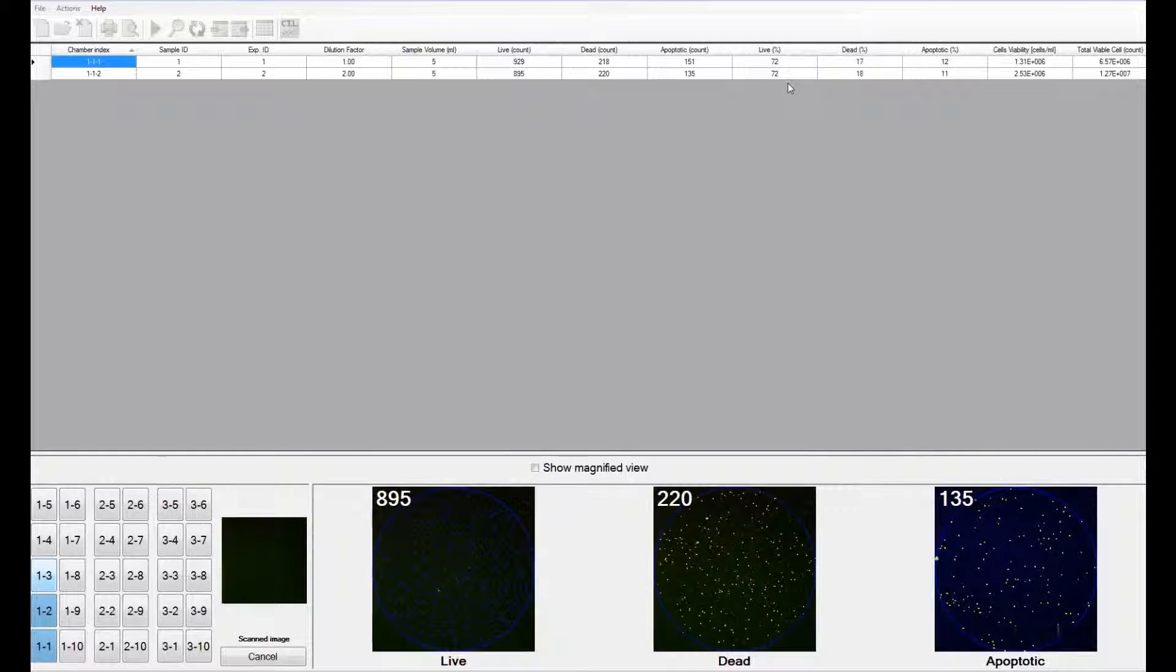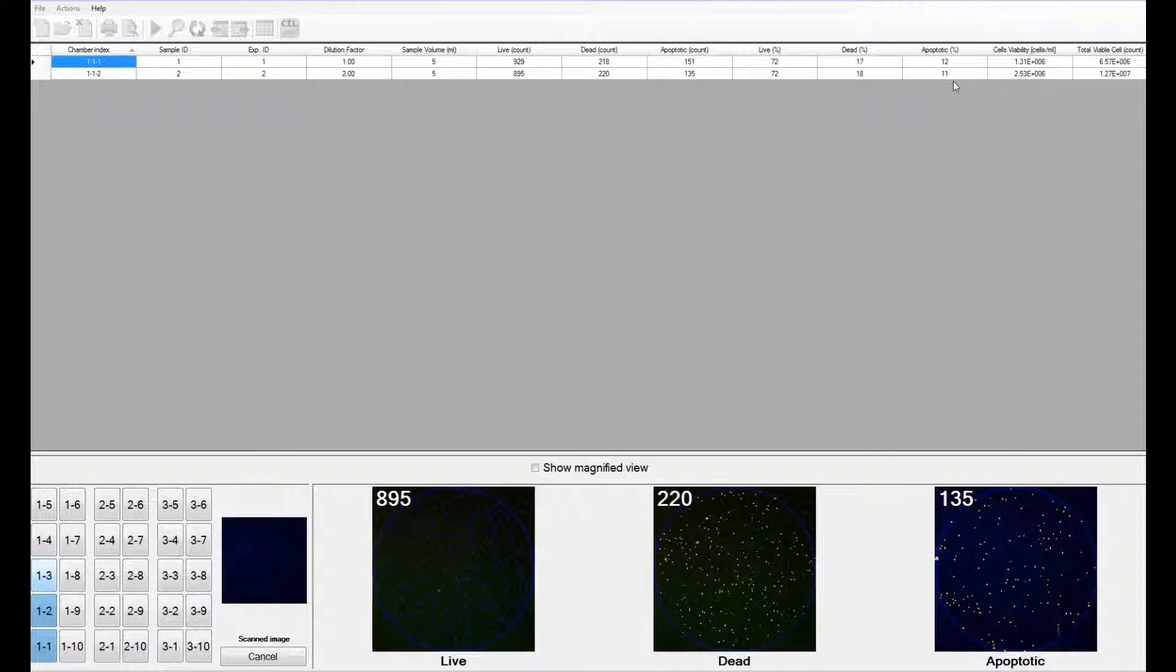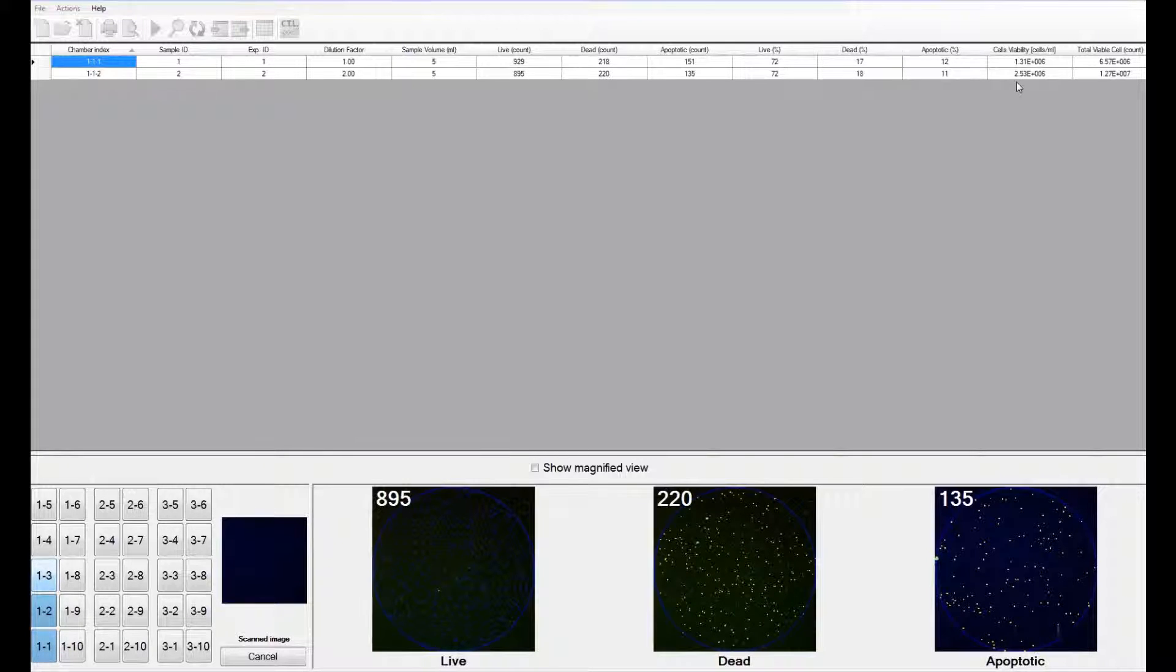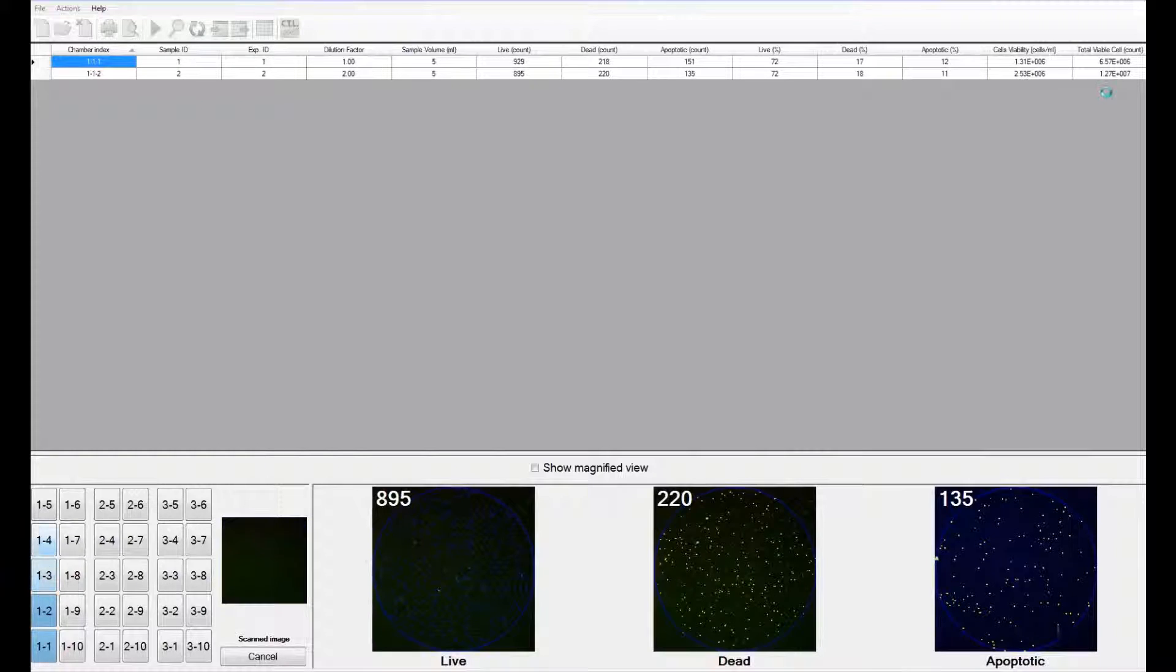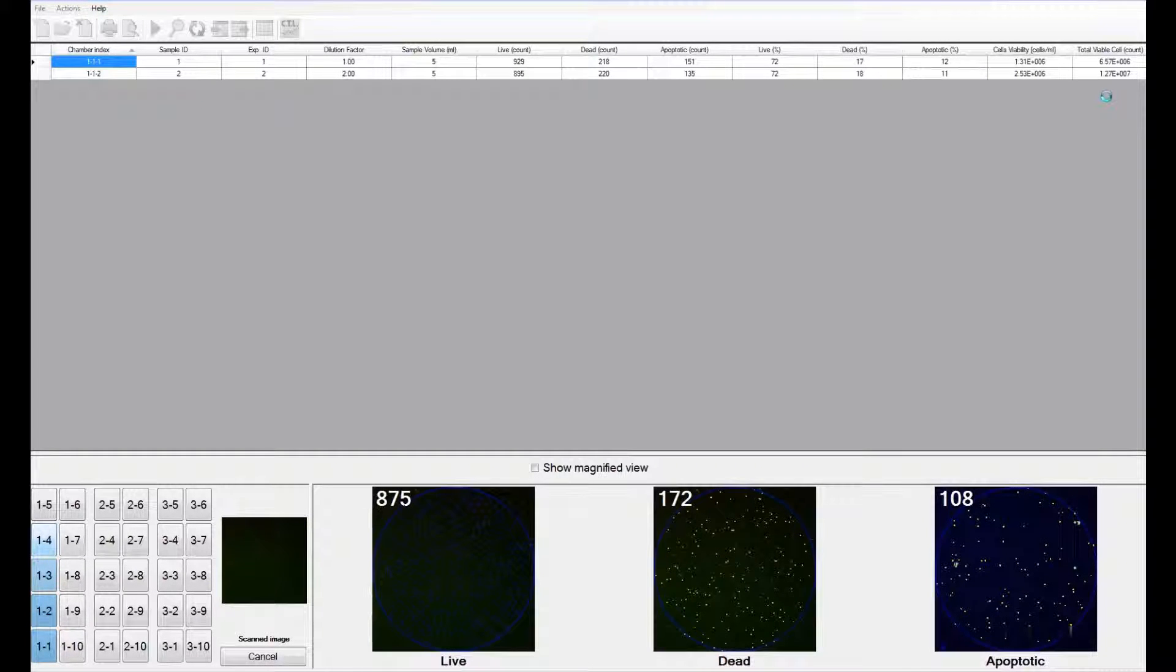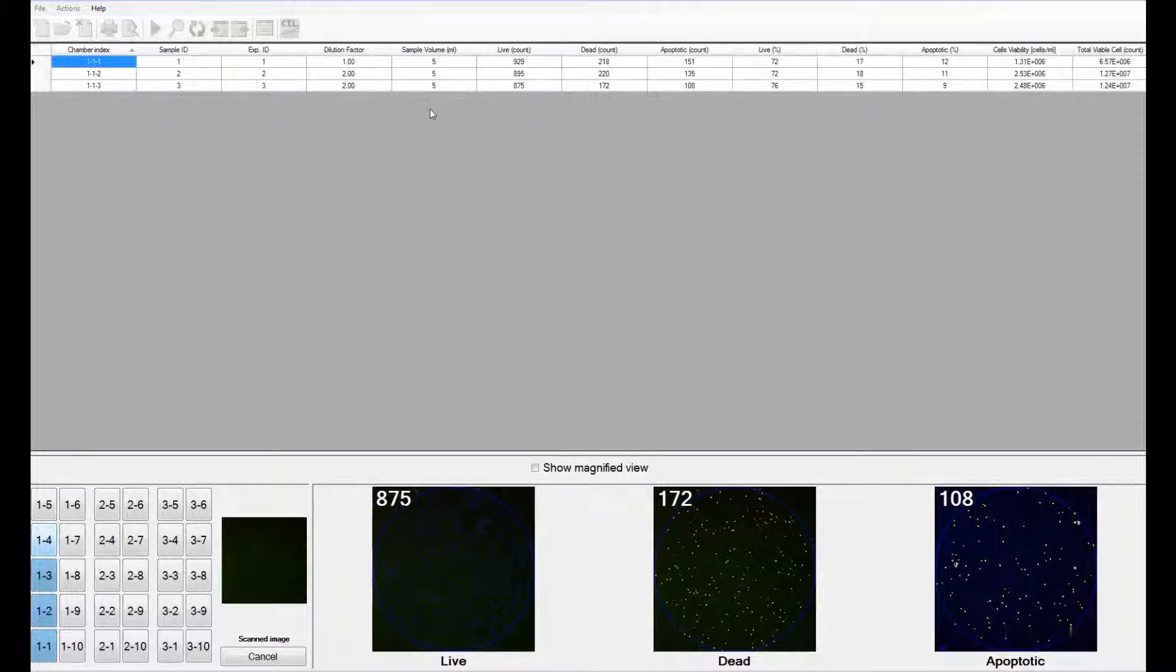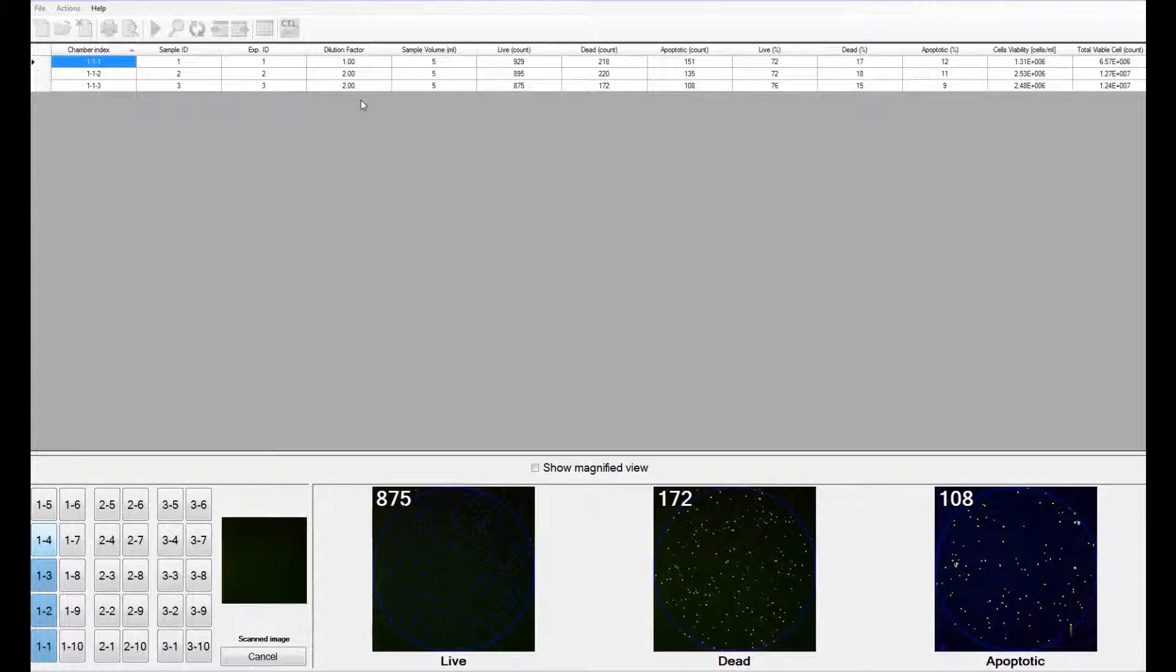It then computes the live percentage, the dead percentage, and the apoptotic percentage. The software also provides the cell concentration in the sample and the total viable cells in the sample. The total viable cells is a representation of the total number of cells dependent on the sample volume and the dilution factor.